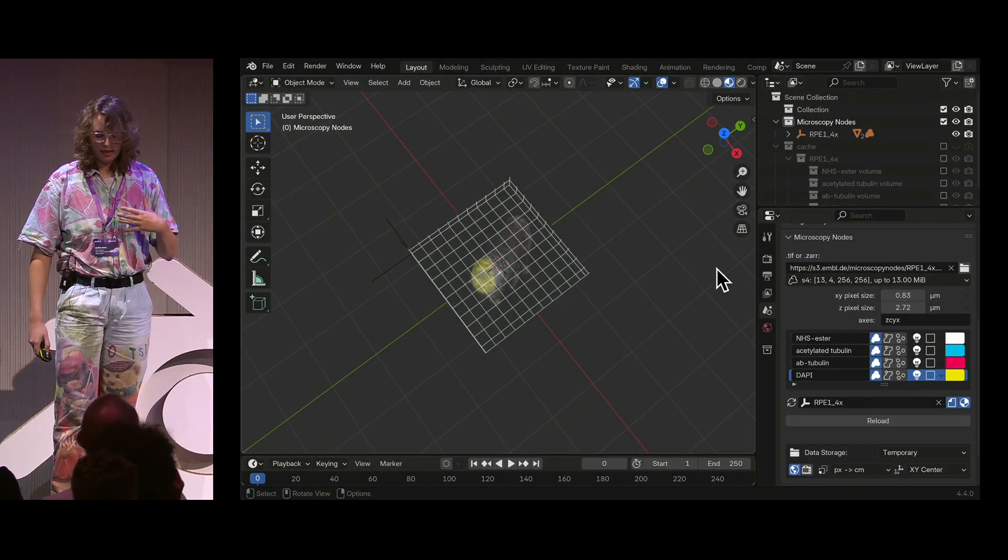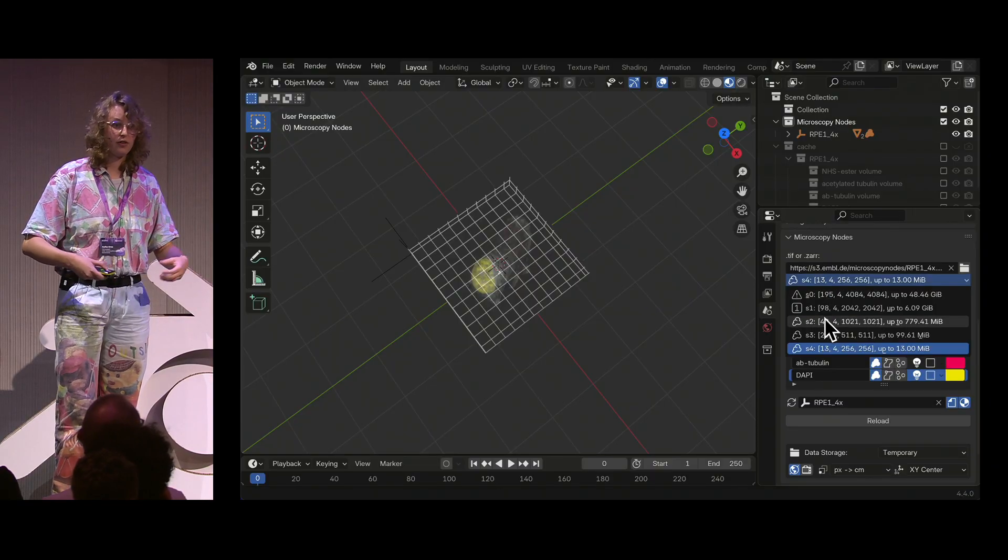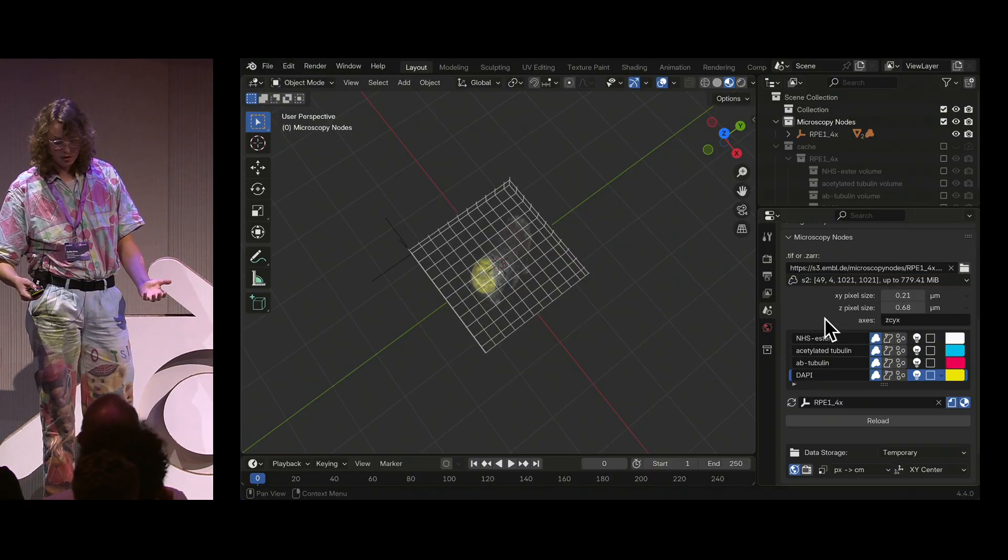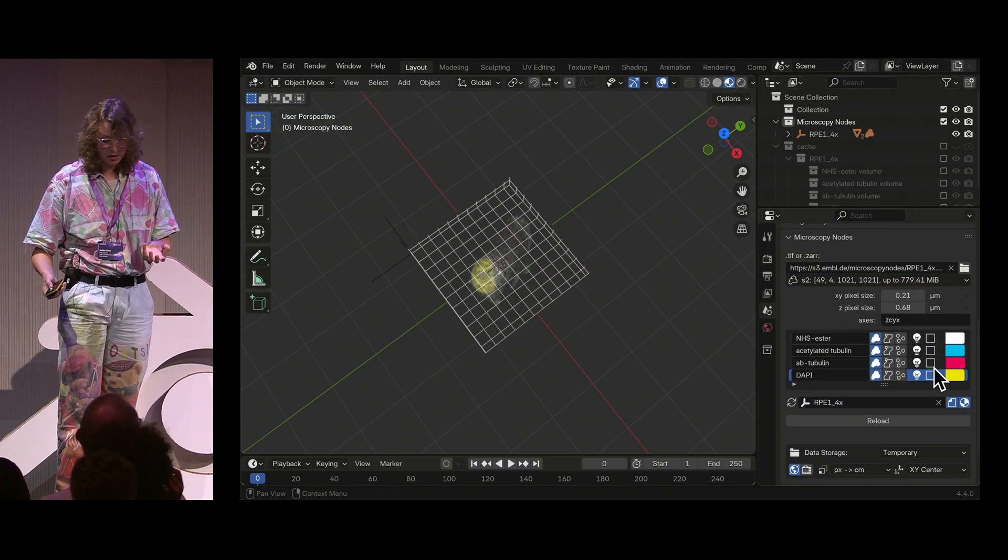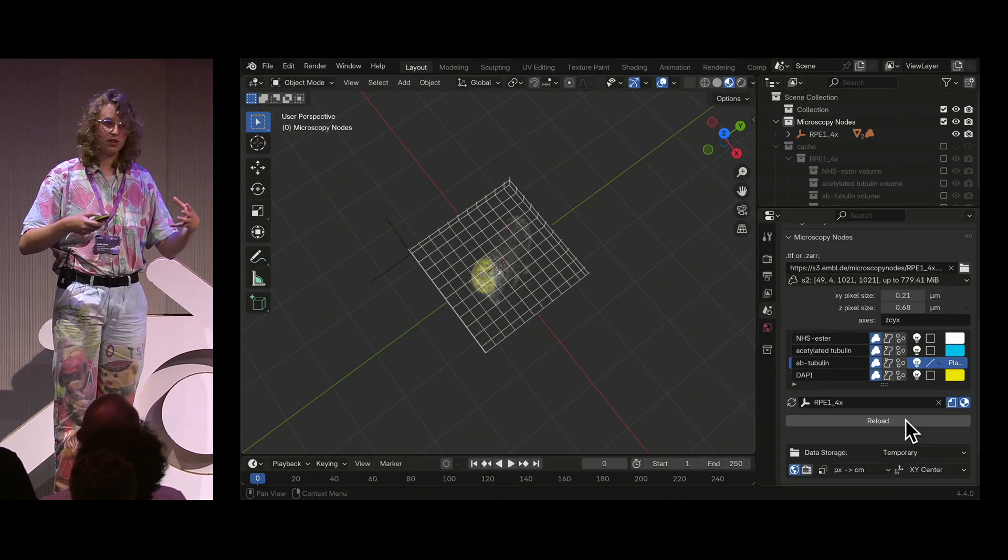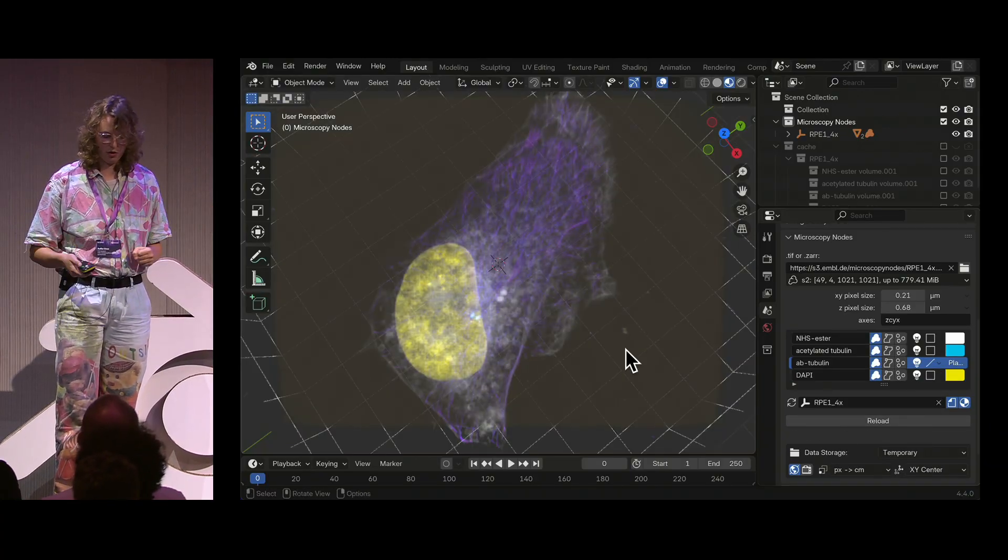And this doesn't look amazing yet, so we can then reload it at a higher resolution, change some of our color maps, and then it will replace our object with this new version.